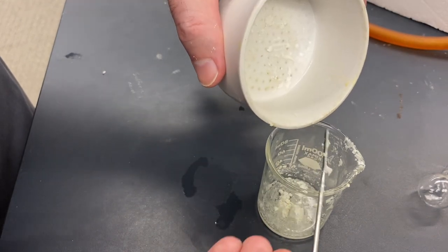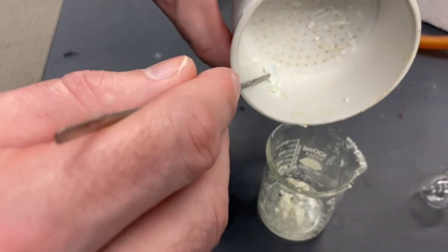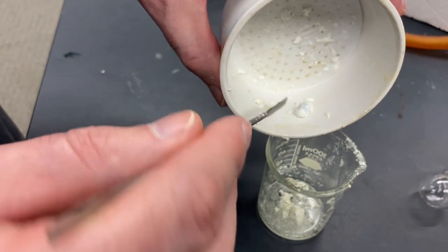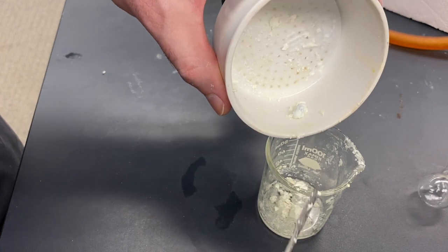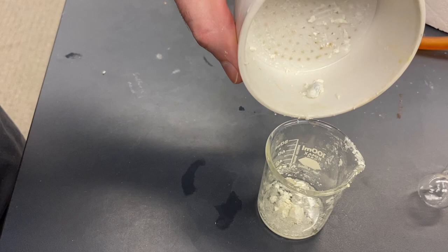The better you can do this by adding the least amount of ethanol that you can, the easier this will be. So go slow on the ethanol and try to add the minimum amount that you can.